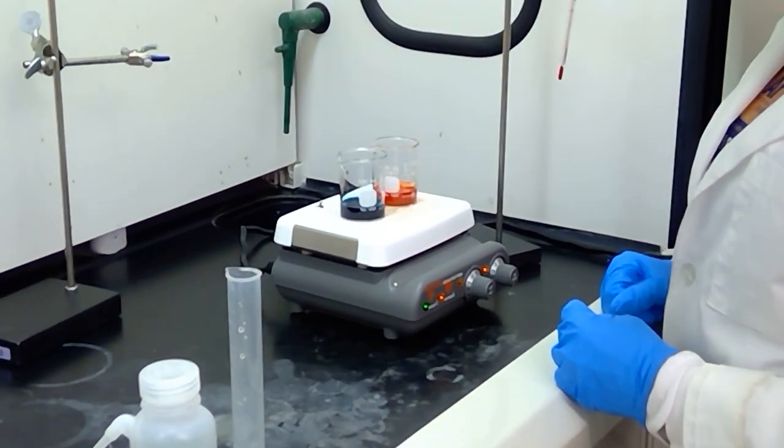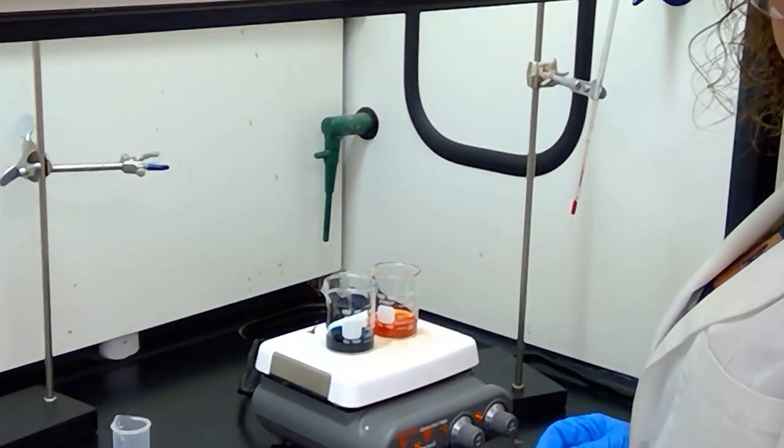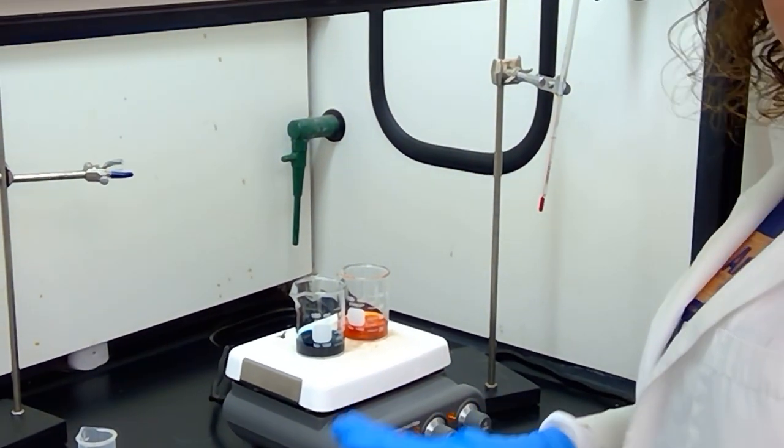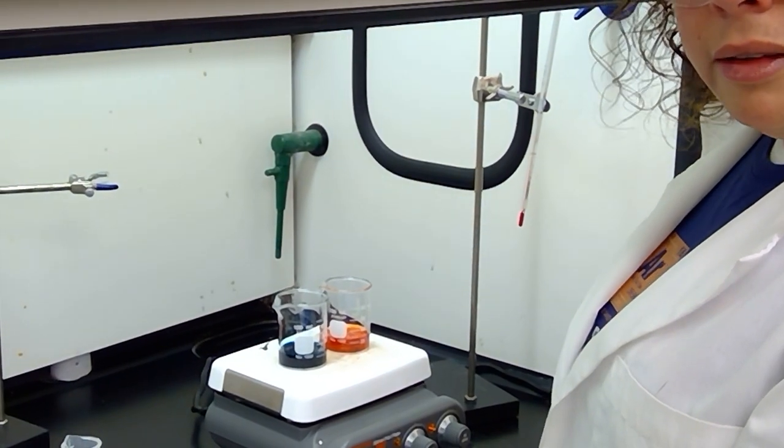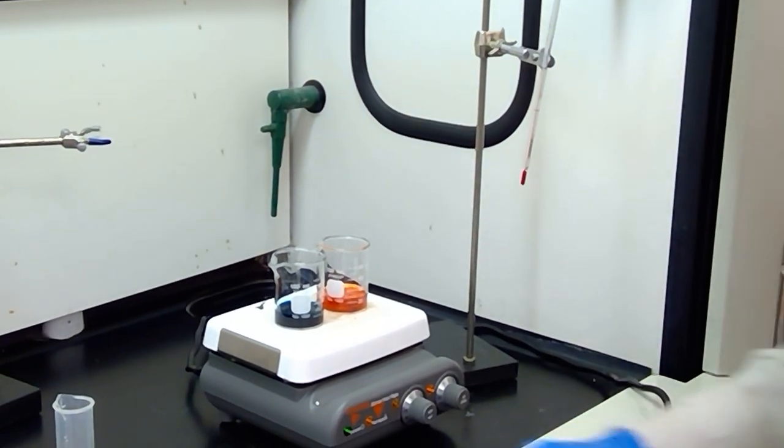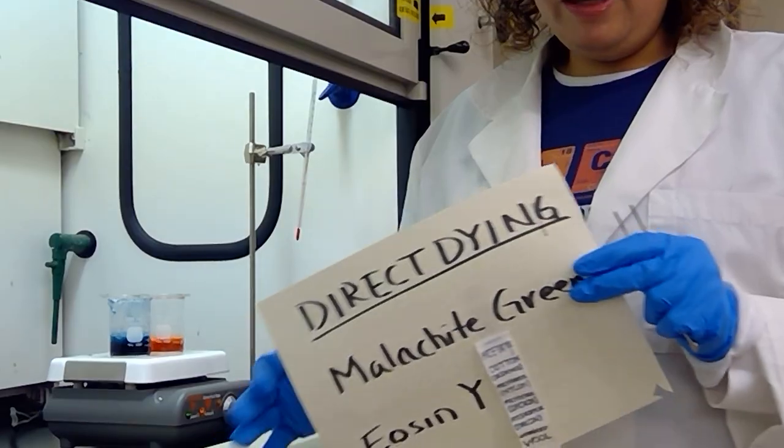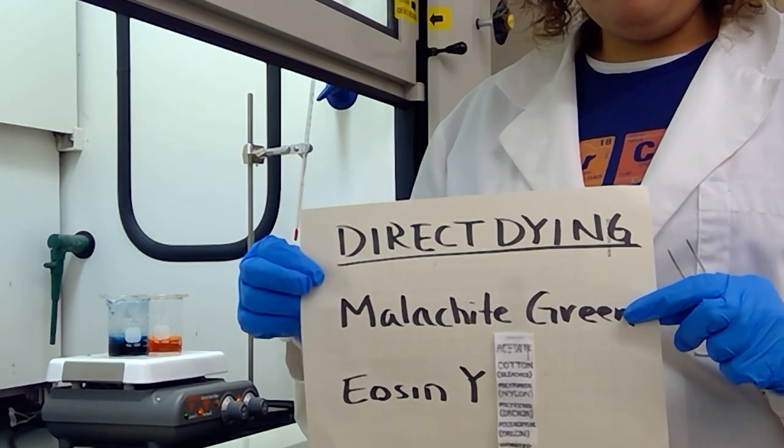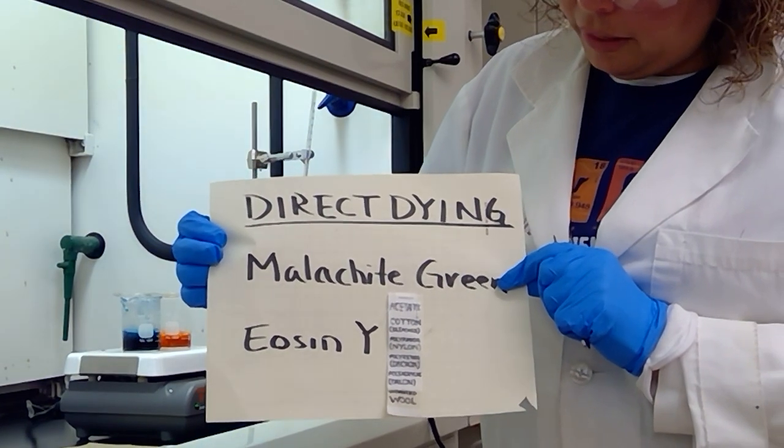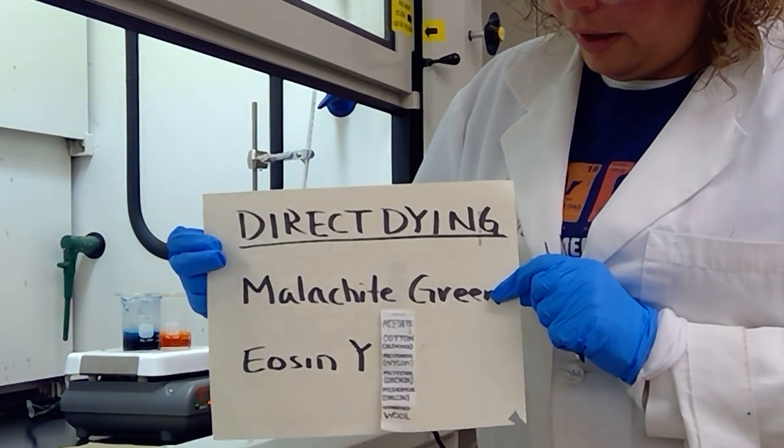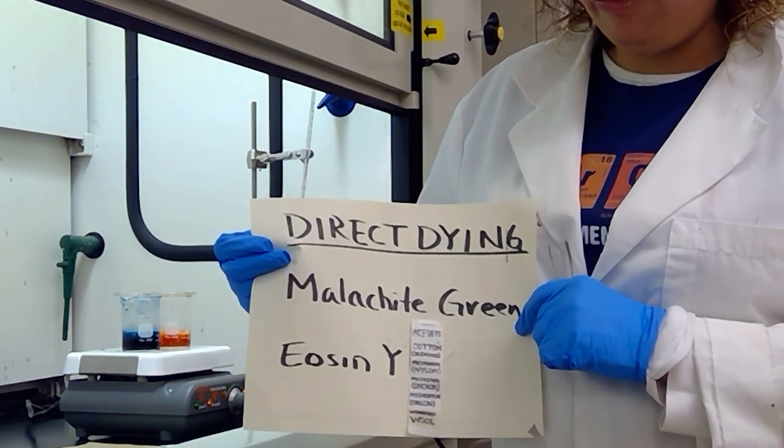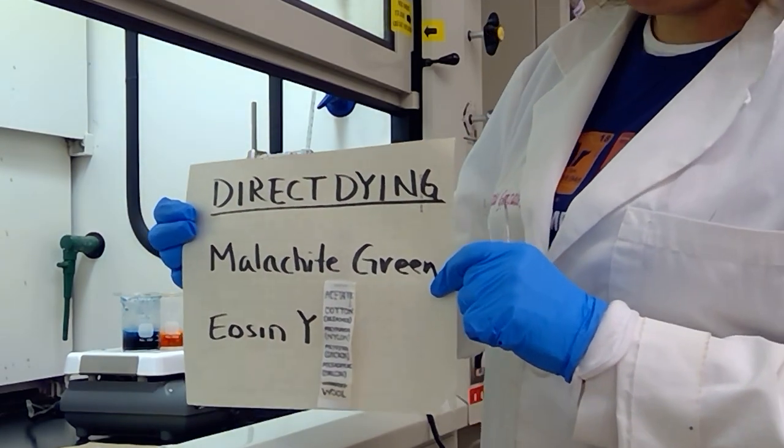Once we get these dye solutions up to a boil, we will add the fabric strip, and I will show you what the fabric looks like against the key that you saw in the beginning so that we can see how the different fibers color with both of these colors. We are currently direct dyeing with the malachite green and eosin Y. Just to remind you about the different multi-fiber fabric strip, we will take a look at what each of these colors looks like once the solution has been applied to the fabric strip.